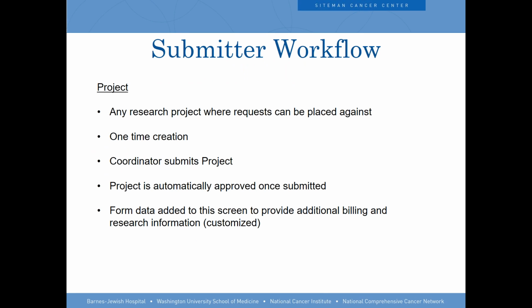So basically, like Lee said about our training, the projects is one of our training modules that he did a great job of, and it actually worked out really well. We used to do in-person training, which was nice for the bigger laboratories, but there's a lot of overhead in doing that, especially if you're meeting one-on-one or you have a one-off request. So having those available electronically for somebody to go into and complete the training works out great. So she created one for projects that they go in and learn about how it works, and then we could set them up as a user to create their own projects and create their own requests.